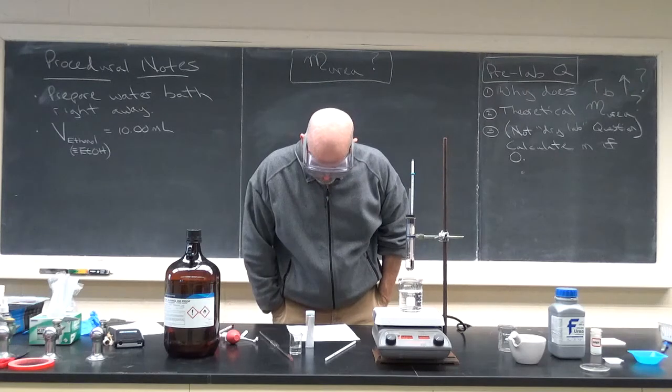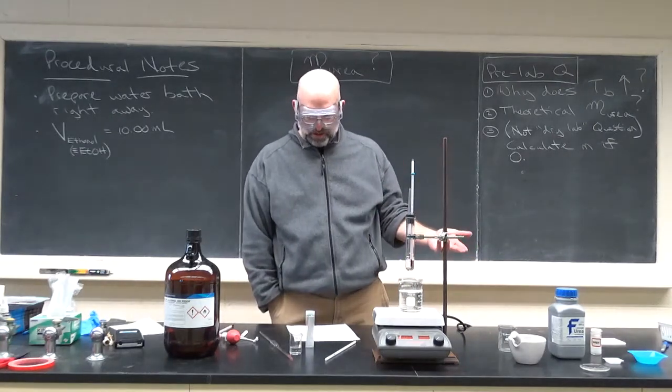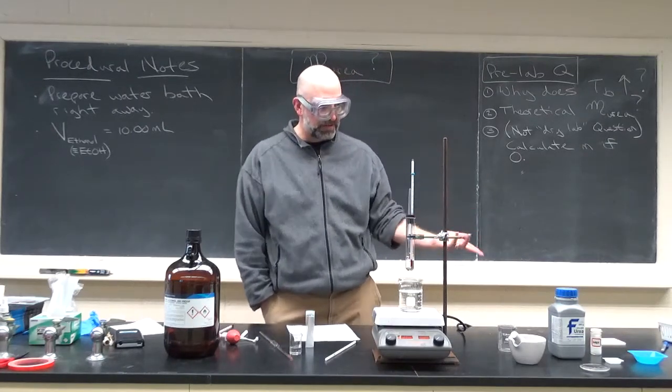Transfer it there. Do not boil the solution. Determine the, okay. So you basically do everything you did before, except you put 1 gram of urea in here. And I'm not going to go through that whole procedure. I just want to show you a couple of things.